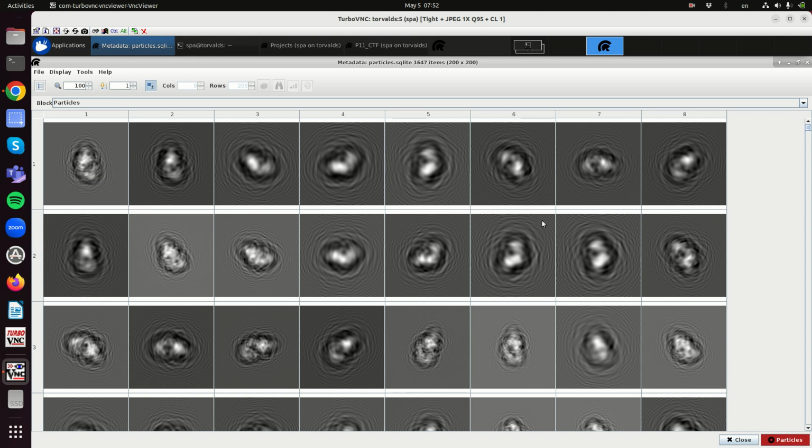And these are the typical defocus values that we use in single particle electron microscopy, somewhere between 0.5 and 2 microns, or 2.5 microns at most. So we have from relatively little spreading of the information to a much larger spreading.